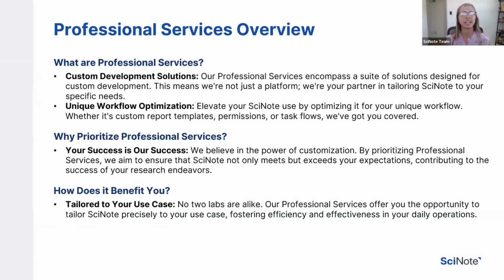Professional services is custom development. It's not just a buzzword, as you are probably hearing a lot these days. It's more a promise that we're going to tailor things specifically to your needs. We're crafting solutions uniquely set up by your team.